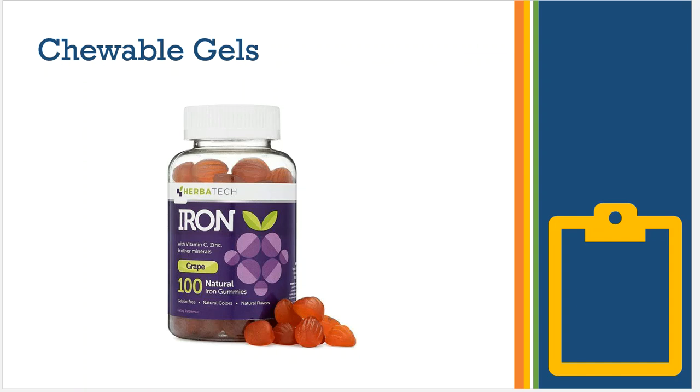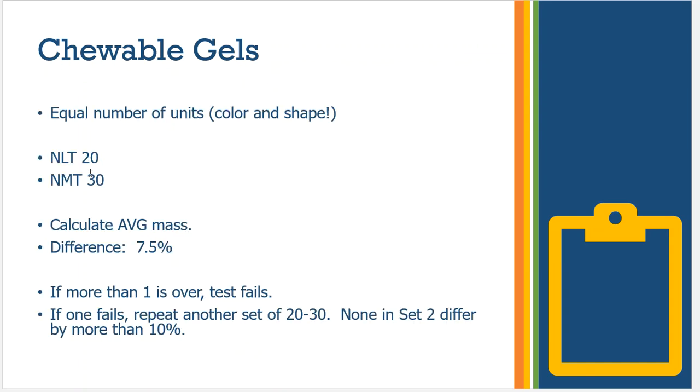Next are chewable gels. These are also a change in the USP-NF. The change was recent, but it's still been a handful of years ago. Dietary supplements can come in this form as well, just jellies or gummies. We call these chewable gels. And they can be dietary supplements in forms of multivitamins or melatonin or anything that you have a hard time swallowing a capsule or a tablet for. So what about chewable gels? What do we do here?